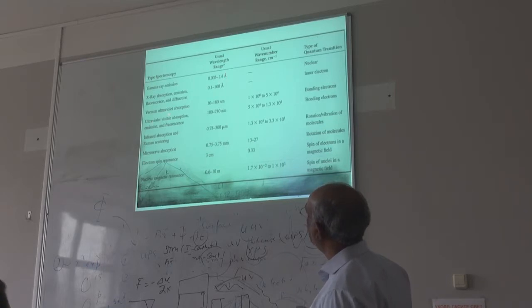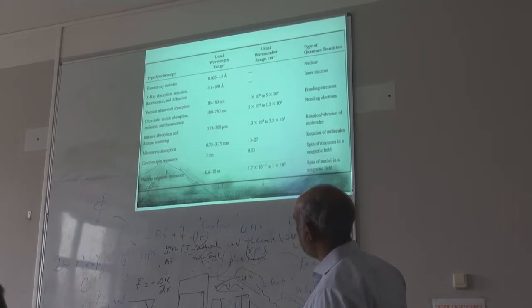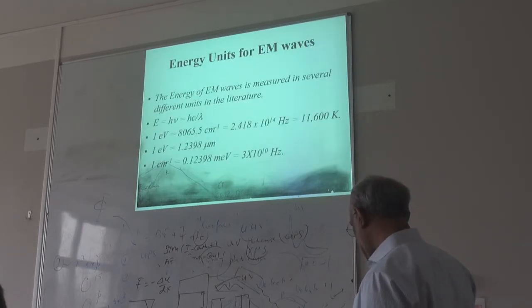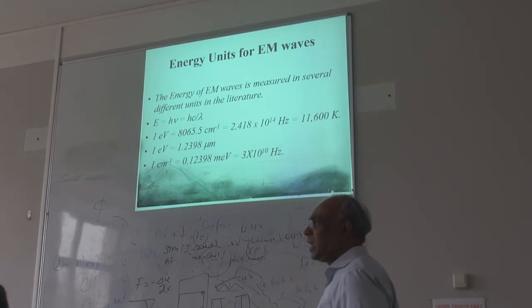But if you use other techniques, this is the optical one, right? So up to here. Then you can have other ranges like microwave. These are gigahertz frequency, so that's a different scale. I'm only going to talk about maybe this part here: UV absorption and infrared and Raman spectroscopy. You can see there are so many different spectroscopies, right, for different length scales and frequency scales.